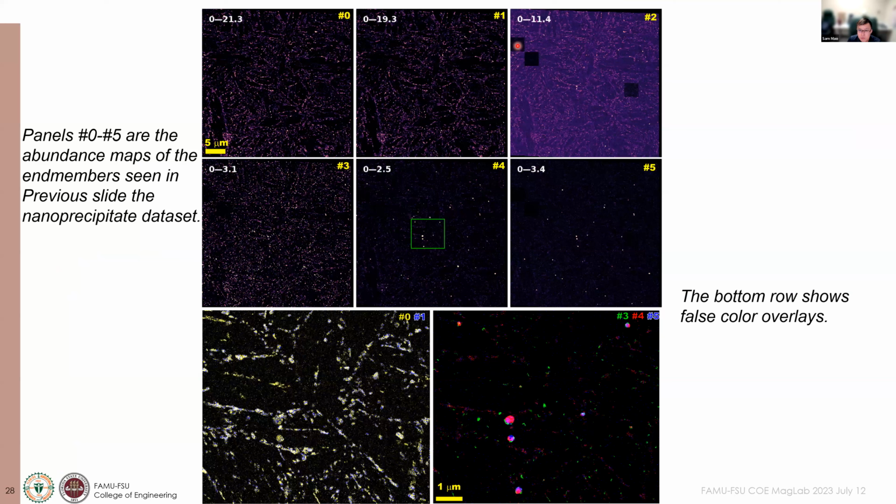But as I'm mentioning, there are still things in development. For example, in this image 2 here, there are some missing tiles during the acquisition, because as I said, the sample might drift during the acquisition, or some other weird things might happen. So you will be able to tune your instrument to an ideal condition. This can be done either in TEM or SEM. Raman or some other spectroscopy, you can also use this method too.